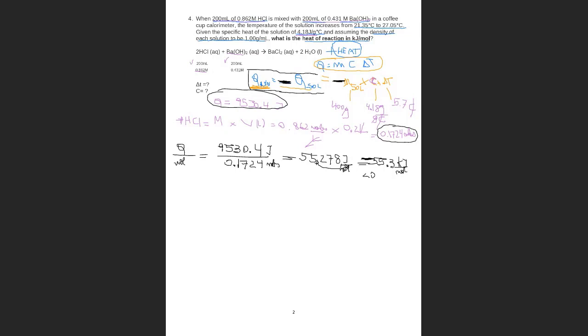So you have a chemical reaction that is giving heat to the solution. The reaction lost heat.